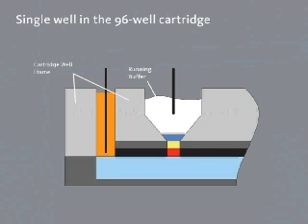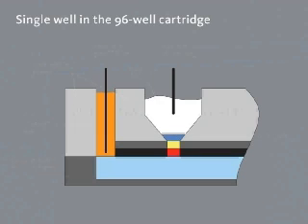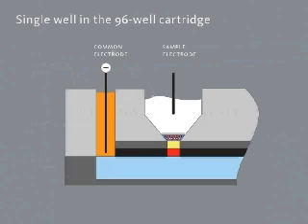Each well of the cartridge is an independent electrophoretic device. When the cartridge is taken into the instrument, a set of 96 electrode pins makes contact with the top of the cartridge. This clever design eliminates direct contact between the instrument's electrodes and the wet sample solutions in each well. At the pH of the experiment, we have both anions and cations in the well. When the run button is pressed, voltage is applied to each sample electrode. The direct current passes through each well according to the direction and duration specified by the software.